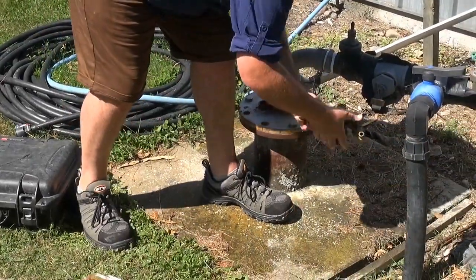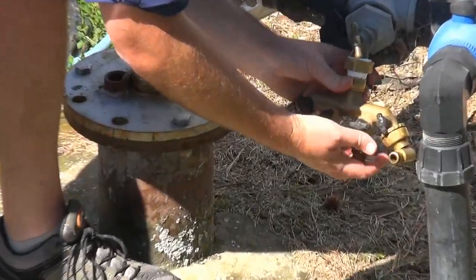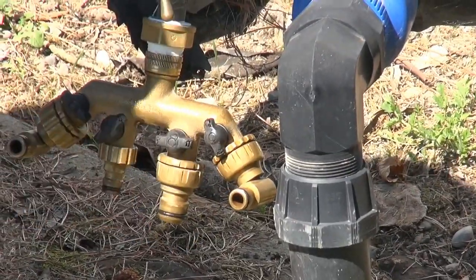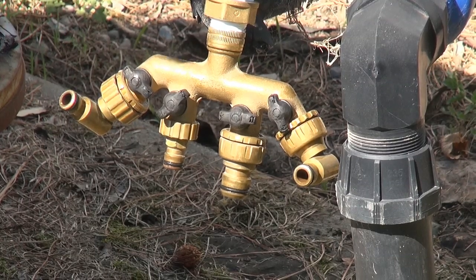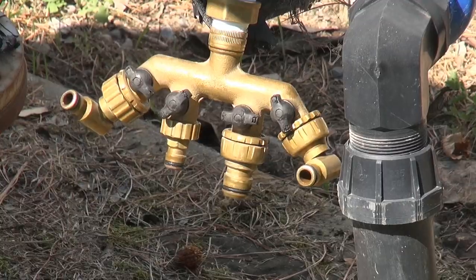Whatever sampling manifold you want is up to you really. I like these sorts of setups — they're durable and easy to come by; these are just from a hardware store. You've got various valves, sample lines, and these fittings are quite useful for altering your flow direction depending on your setup. Then you've got purge lines and flow cells.